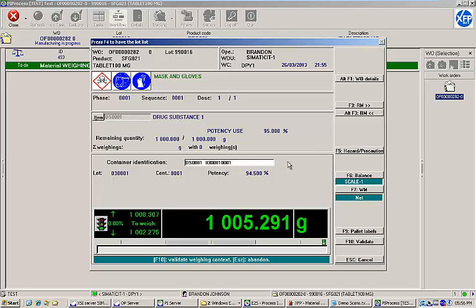You can see that based on this tolerance, the BOM line has an upper limit of 1,008.307 grams and a lower limit of 1,002.275 grams. I'll click the Validate button to confirm my source container selection and record a container tare weight of 100 grams.